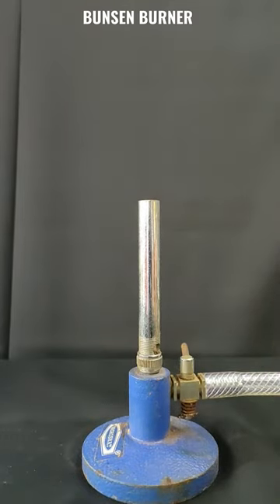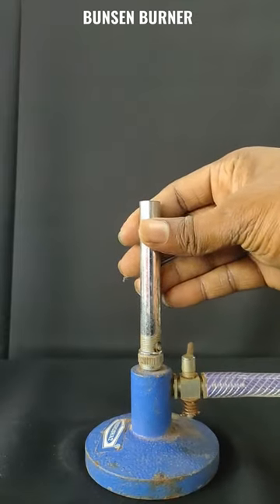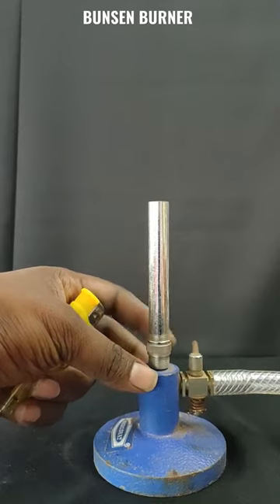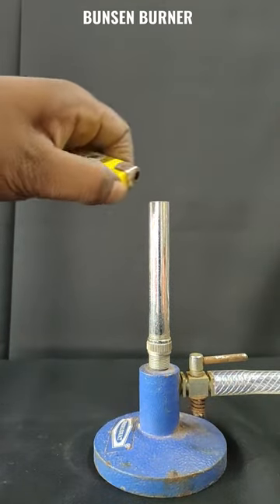How to turn on a Bunsen Burner. These are called air holes. First, we have to close the air holes, then turn on the valve, and light it up with the help of a lighter.